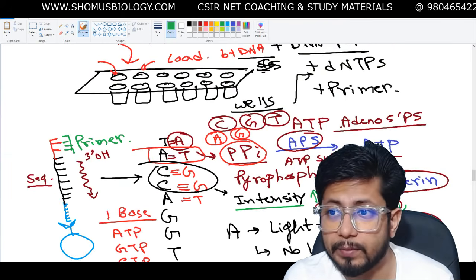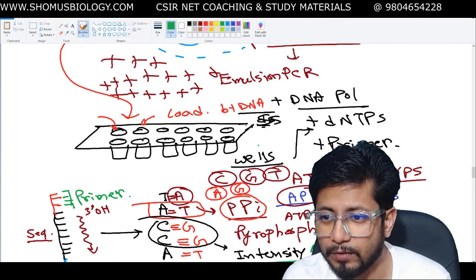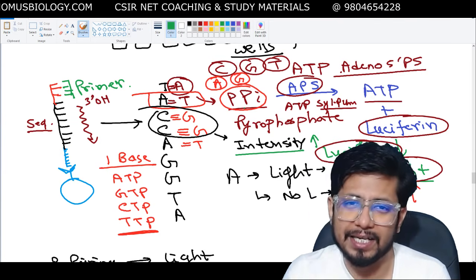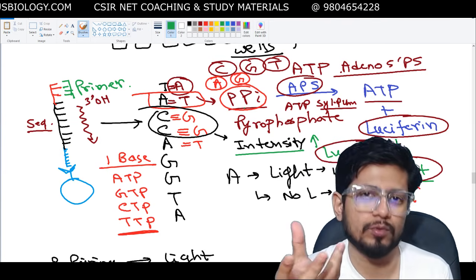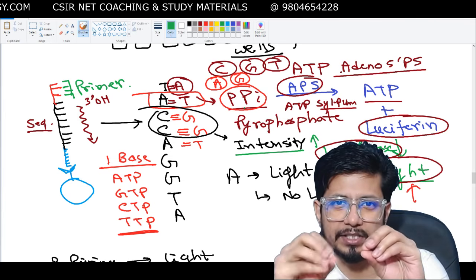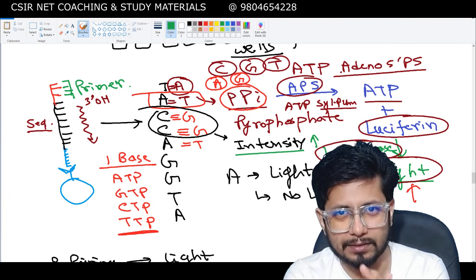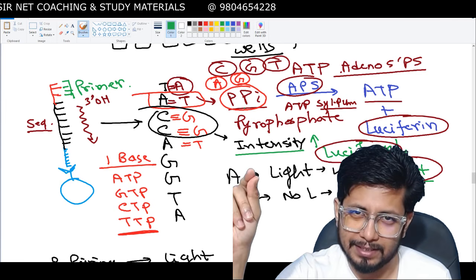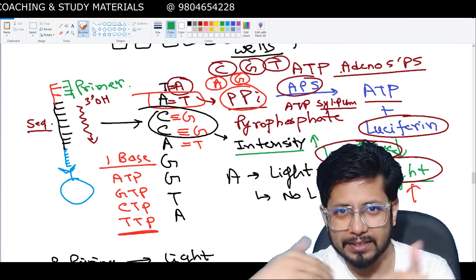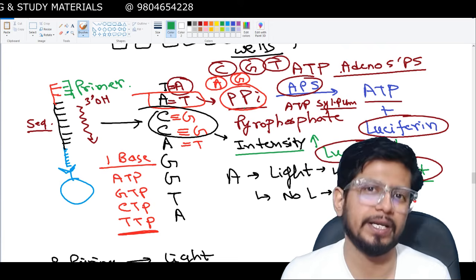Why is it called pyrosequencing? Because it uses this pyrophosphate that is generated as a result of the new nucleotide addition and conversion of that ultimately to visible light. So basically lights shining on top of the beads. Whenever we see light shining on top of the beads, we already get it. If the light's shining, the proper binding happens, right? Sequence is known. If no light, no binding, so that is blank. So either the sequence or the blank. With this idea, our computer can analyze the sequence and give us the full data about the sequence.